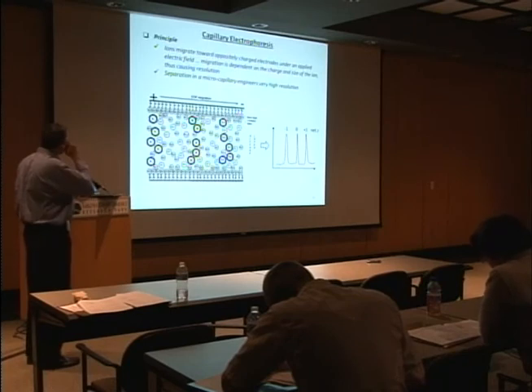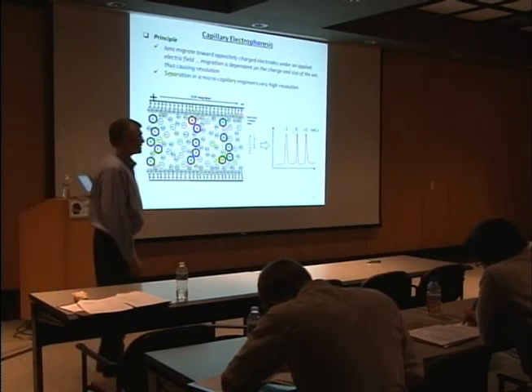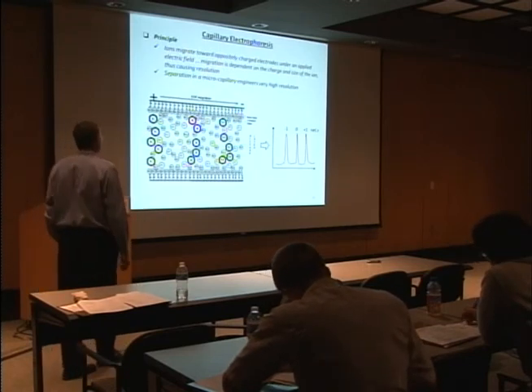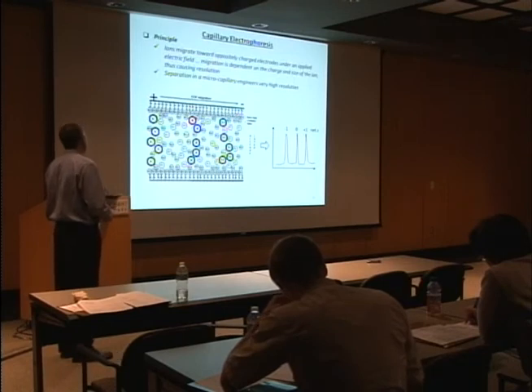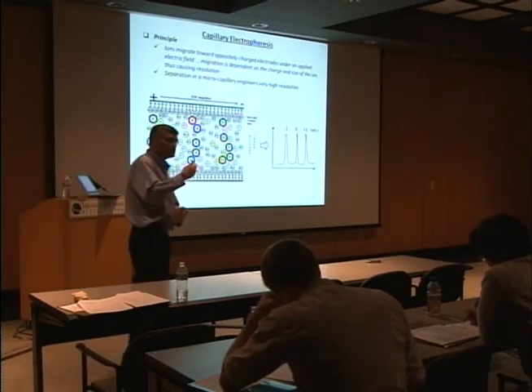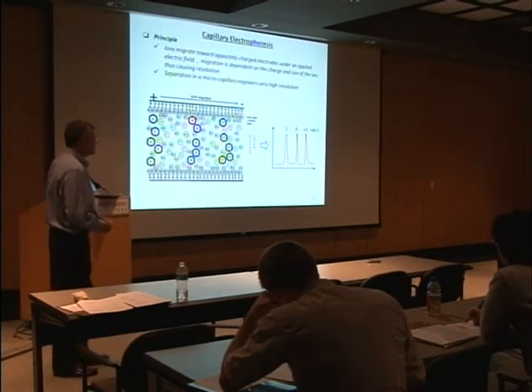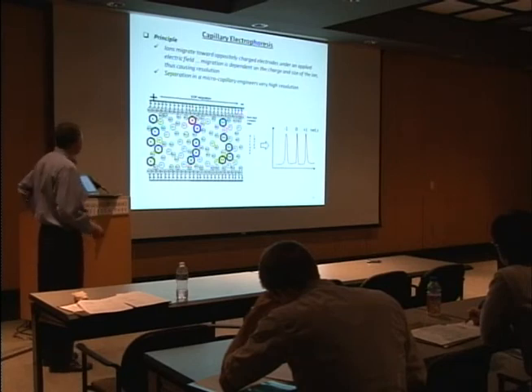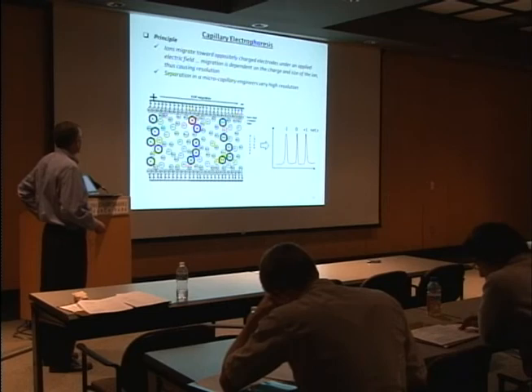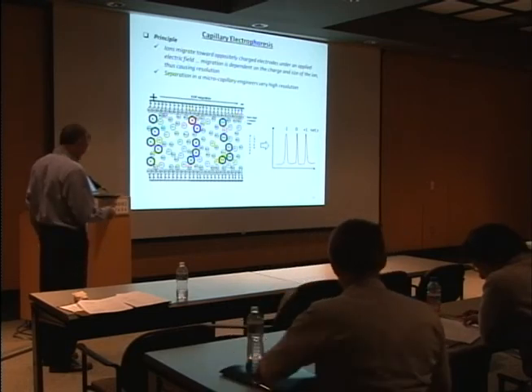Capillary electrophoresis. Now, this is a technique that is very useful for GAGs because it gives good information in terms of what GAGs are, and this is one place where most people typically go to. This in combination with, for example, UPLC MS monitoring of composition forms a really nice combination of techniques to figure out what GAGs we are dealing with, and I think that's really important.